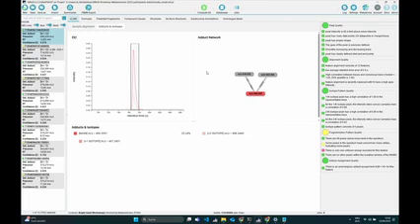Let me think if I got the question right. To check for an infection, you would do some comparative study, right? We do not yet do any statistics here. In the future, we will be able to mark your runs, whether they belong to one or another condition. But in general, you are not limited to a specific realm of compounds or something like that. So it doesn't matter whether they are from human or from fungi. Is that what you mean?